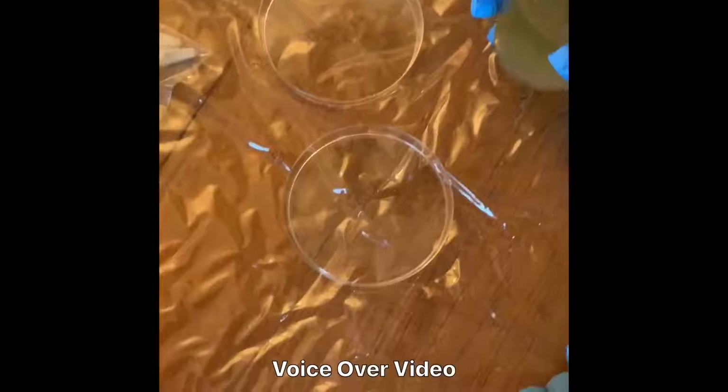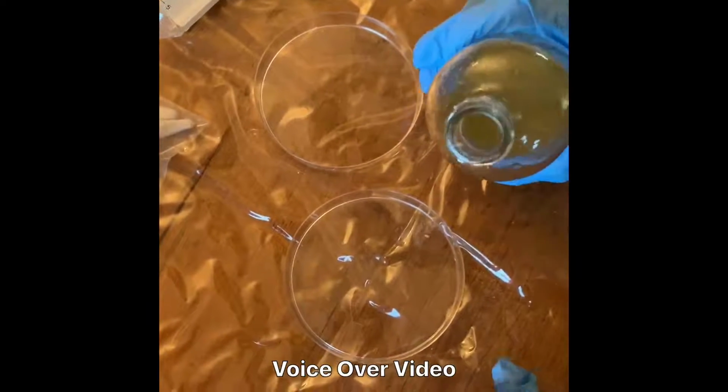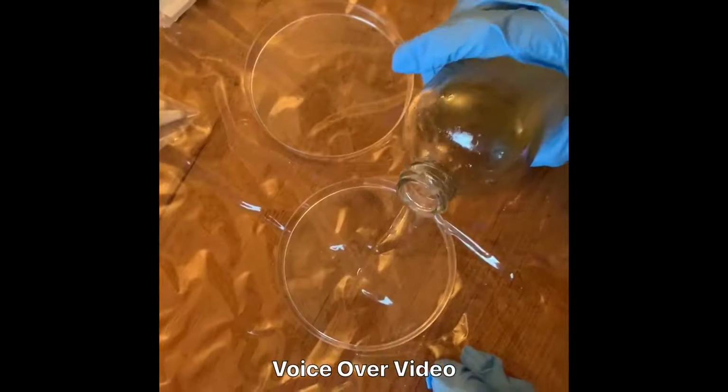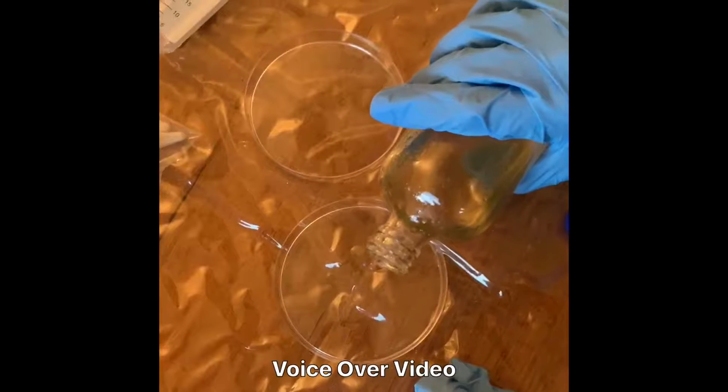It's in the microwave, and then I took it out and put it in, just so it covers the whole bottom. Both of the 2 plates. Okay, 1, 2, 3. It's full for the bacteria.